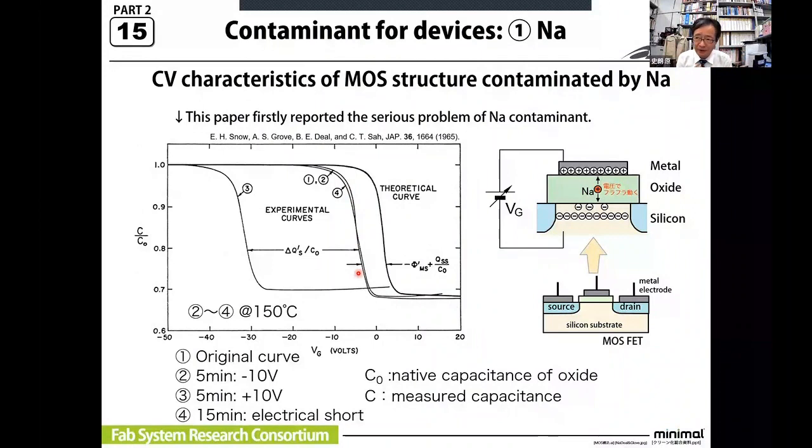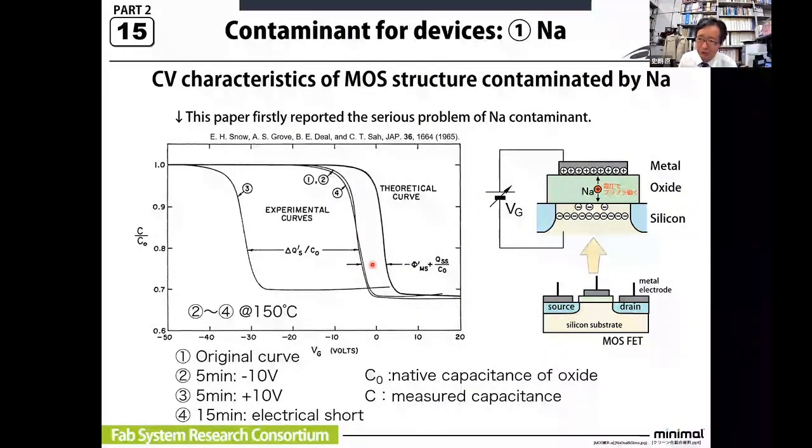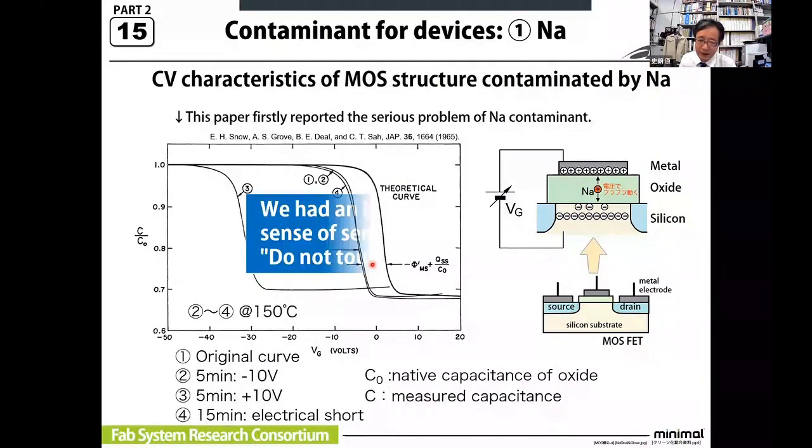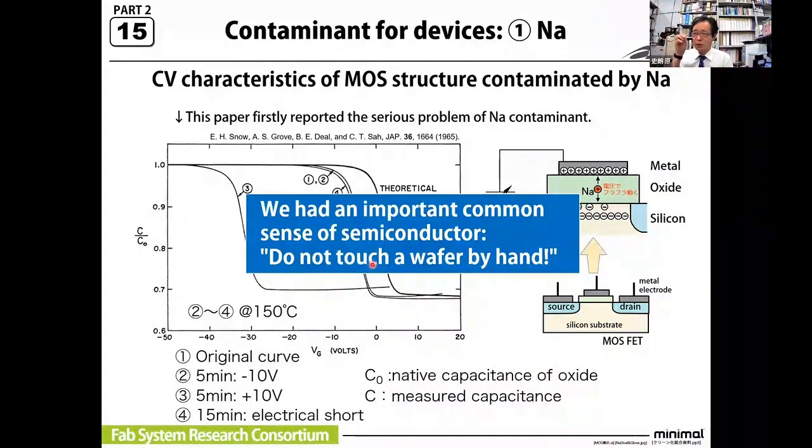So this is a very interesting, unbelievable, wonderful experiment. So after that, we had an important common sense of semiconductor: do not touch the wafer by hand. Your hand has sodium, of course.